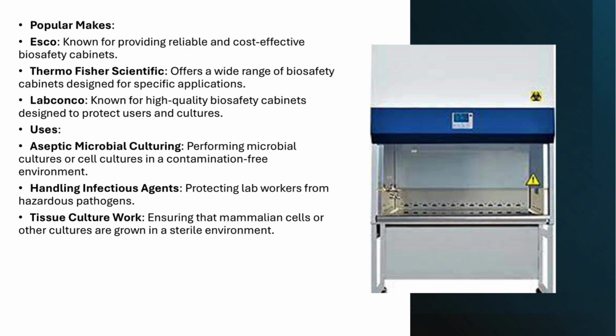When it comes to reliable biosafety cabinets, brands like ESCO, Thermo Fisher Scientific, and Labconco are trusted in the industry. These companies offer a range of biosafety cabinets tailored to specific lab needs, ensuring maximum protection and reliability. So, what are some of the primary uses for biosafety cabinets in microbiology labs?